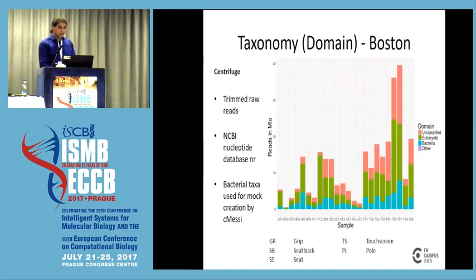Same goes for the Boston data. Here you can now see that the sequencing depth is in a much, much higher range, which was already mentioned previously, and there are samples with a huge majority of eukaryotic reads, with sequencing from 40 million to less than 1 million. So that is much more difficult to assemble as well, with some examples. I will show that later on to give you a rough idea what the input data looked like.